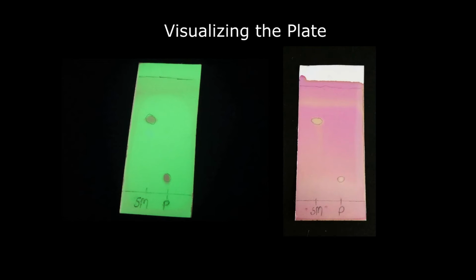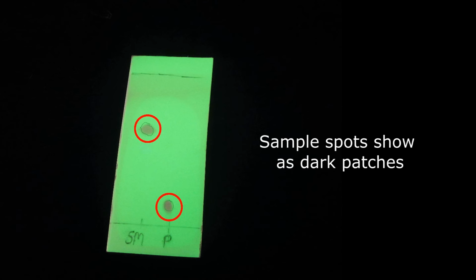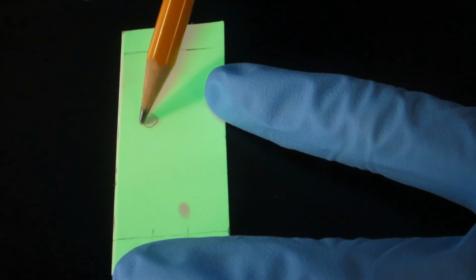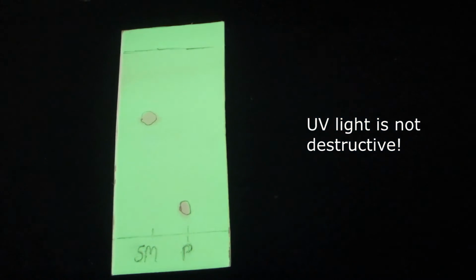There are many methods of visualizing a developed plate that will depend on the sample. Common techniques include viewing the plate under UV light and staining the plate. Most TLC plates contain a fluorescent additive that allows samples to be viewed under UV light. Sample spots will appear as dark patches on a greenly glowing plate and can be circled with a pencil for later interpretation. This technique is not destructive and can be repeated as many times as desired.